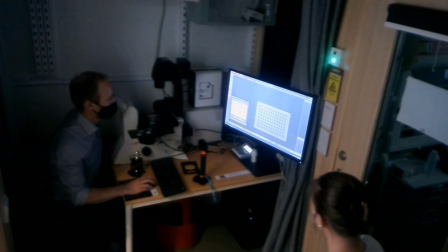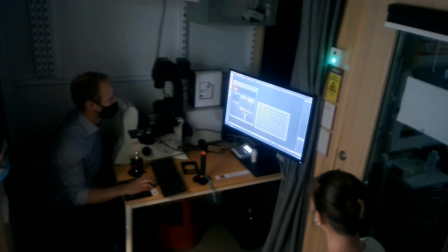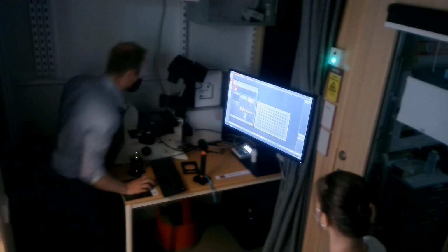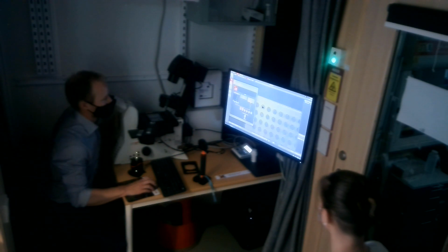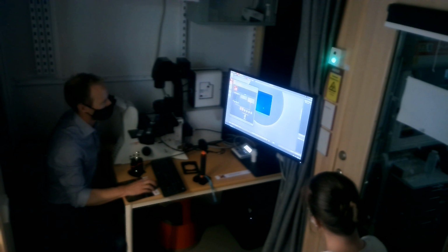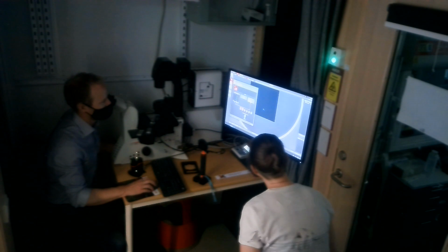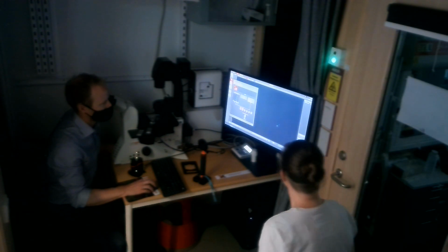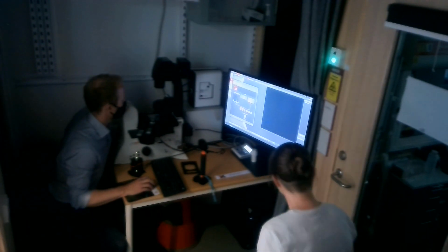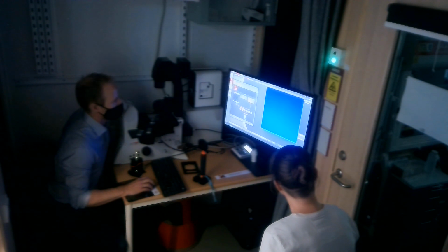So these are live cells now. Yep. Okay. Let's see where we are. Yeah, it's in that position. Okay. Yep. So we're in the right position now. I will go to the 20x. It will not work, and actually I'm not getting past it even, so I can see.